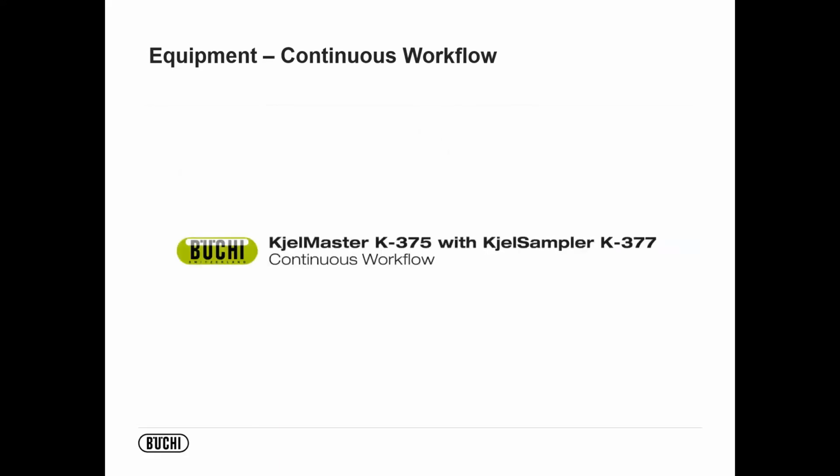So again, internal reflection: is my lab or my organization something that needs to run 100 plus samples a day? If that answer is yes, this is probably a very nice, valuable tool for you. If not, maybe not really the best fit, but just something very nice that's offered to meet any demand that may become available.